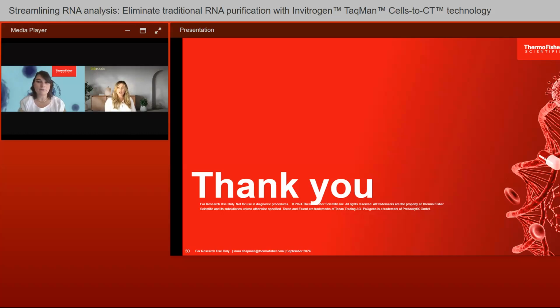Now, Laura, how can this project be utilized in oncology? That is a great question. I do know that there have been some folks looking at, like I mentioned, for the Fast Advanced kit, looking at spheroids. And so that could be an option that you would use for oncology if you're looking potentially at tumoroids. We haven't done a ton of work with those particular sample types, but that could be an option.